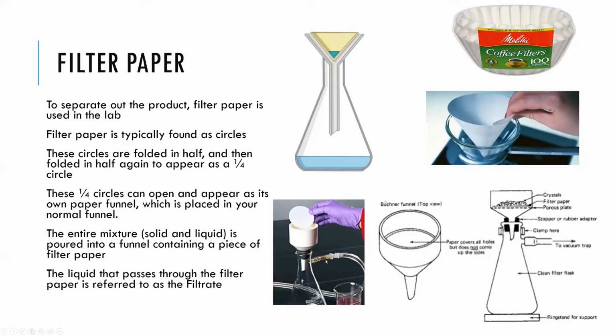So in all three of these first reactions, you're combining them, they're forming a precipitate, and then you're passing that mixture through filter paper. And utilizing filter paper is a lab technique that's used a lot in different chemistry labs. In general chemistry, it's used a lot in organic chemistry and analytical chemistry, as well as a number of other different lab settings. Filter paper is really just like coffee filters.